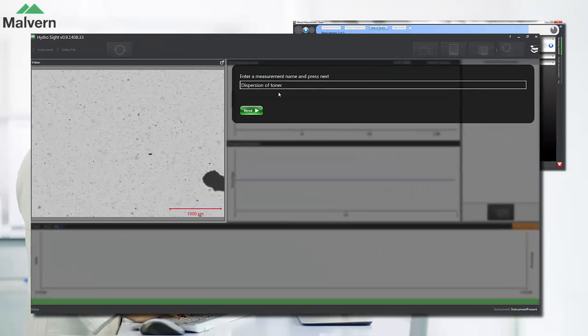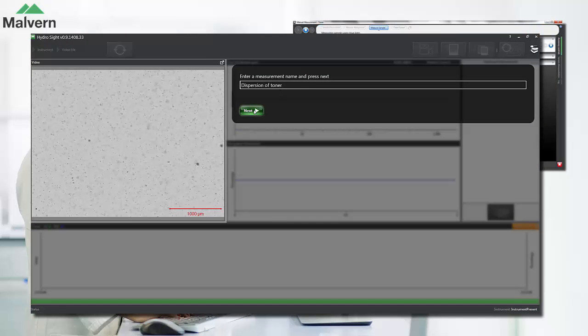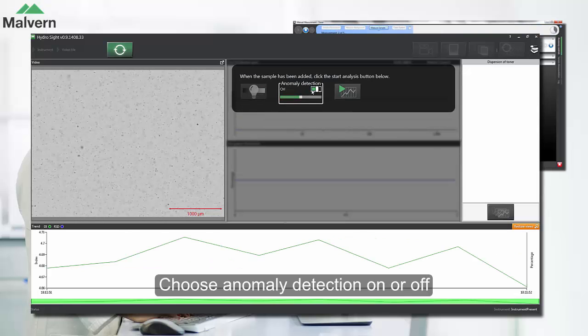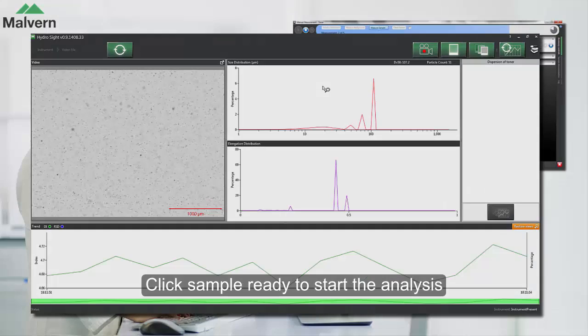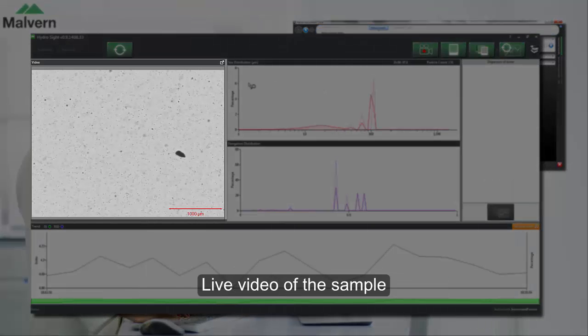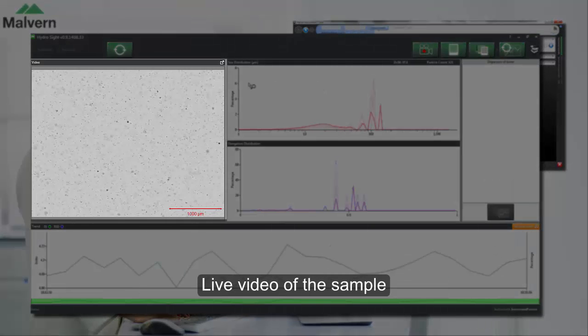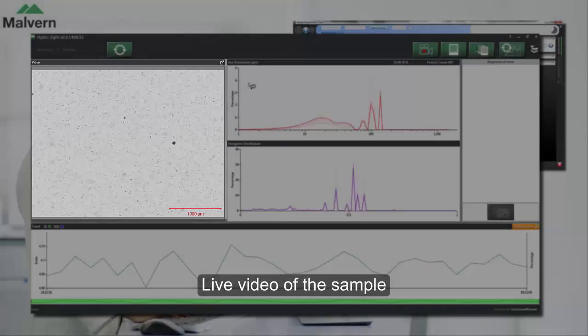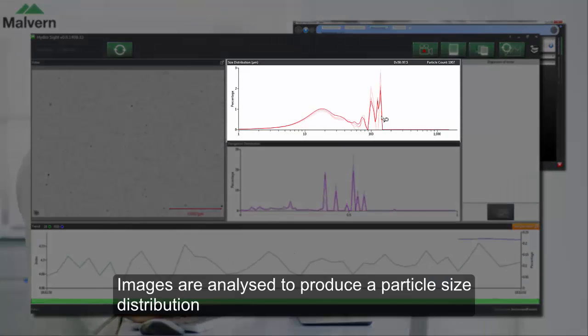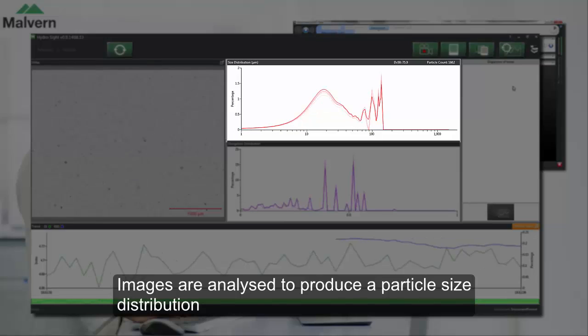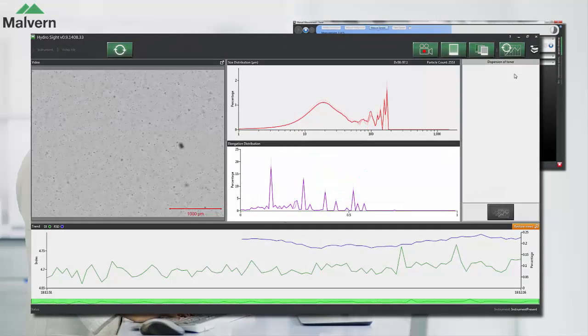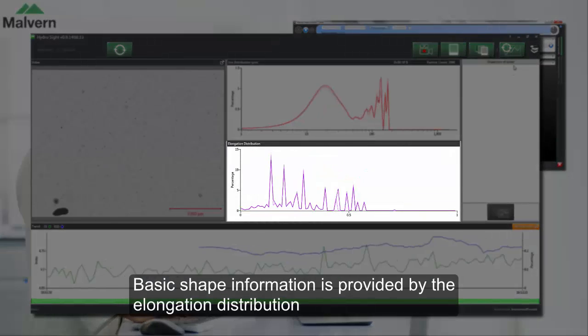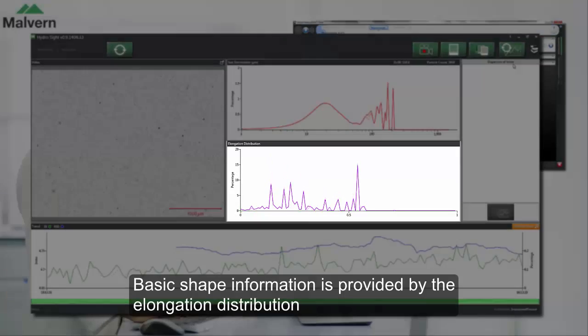We can then start the analysis in the HydroSight software. In this case we won't use the anomaly detection, we'll cover that feature elsewhere. The HydroSight software shows you a live video of your sample as it circulates around the MasterSizer. Those images are then analyzed to produce a particle size distribution, and basic shape information is provided in the form of an elongation distribution.